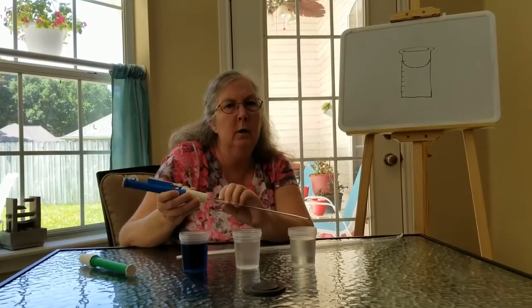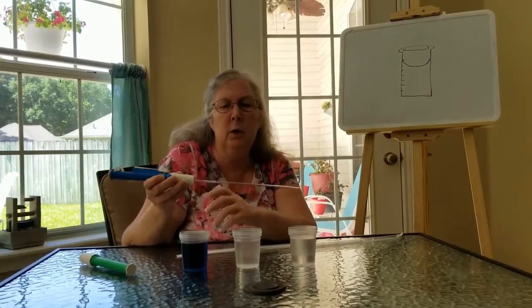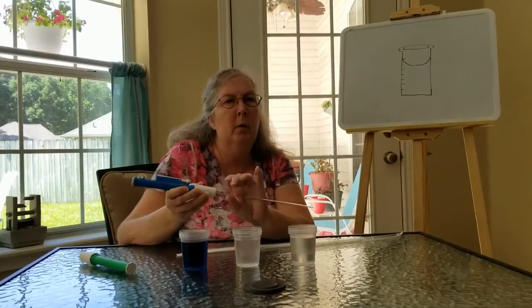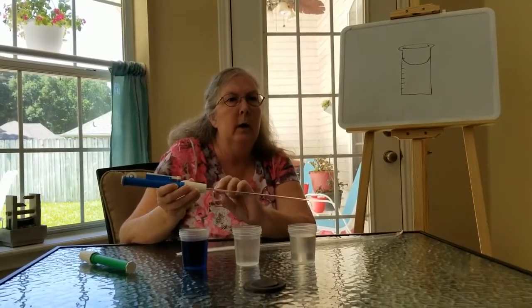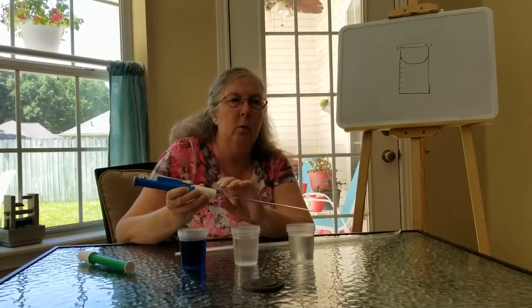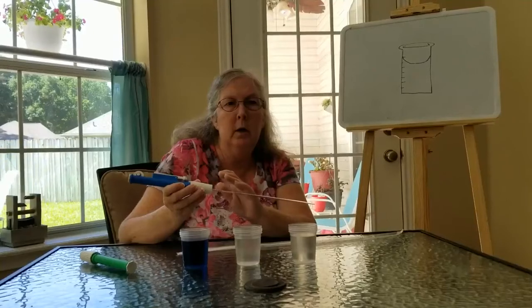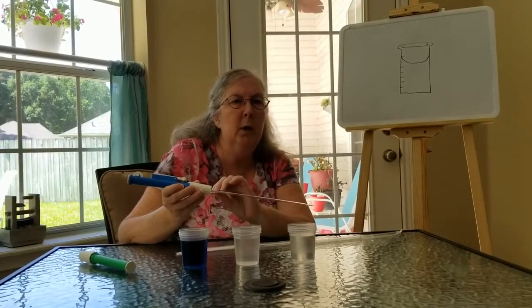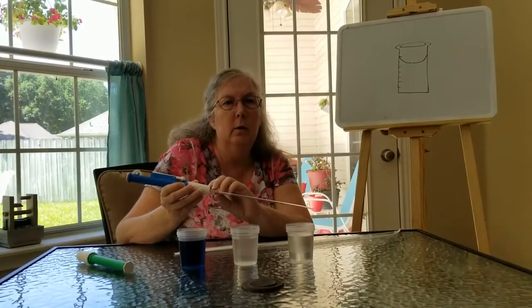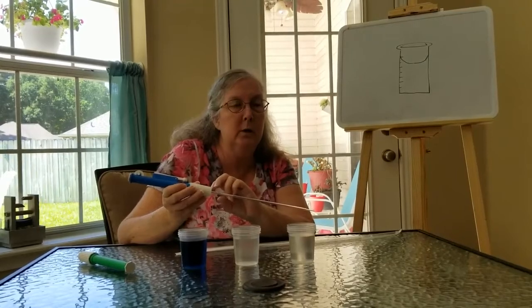When you are done, how you dispose of the pipette depends on what you're working with. If you're just working with water, or if you're working with sterile media, the pipette can be disposed of in the regular trash. If it has come in contact with any type of microorganism, so you're working with fluid that had already been inoculated, then it's considered contaminated. You need to dispose of it properly into the solid contaminant waste, usually the large red waste container.